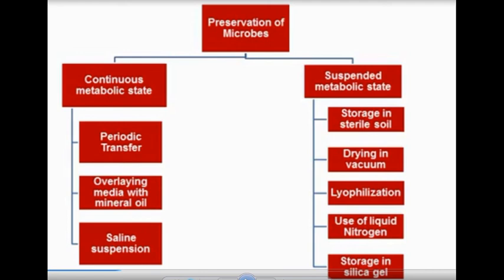Storage in silica gel is similar to storing in sterile soil, which is mostly used for spores. Okay, thank you.